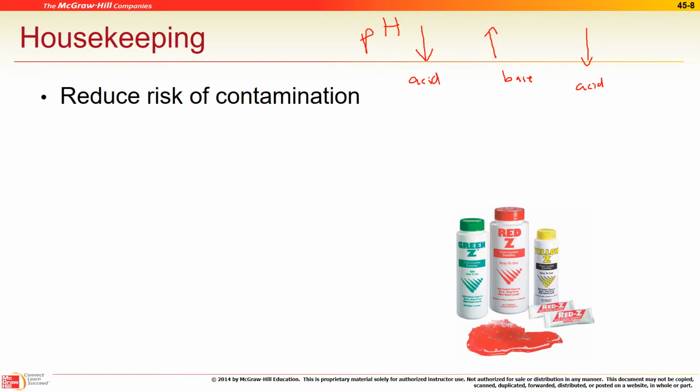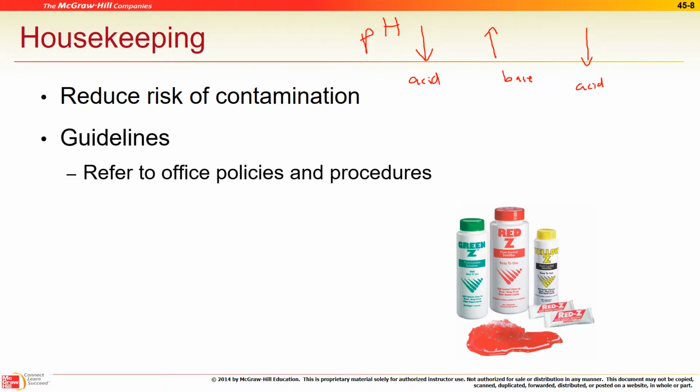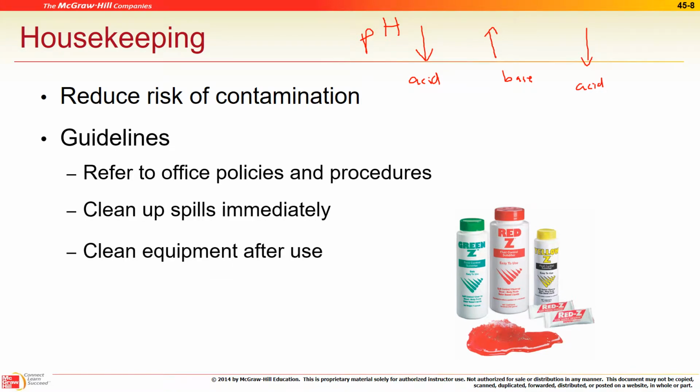This is the same in hospitals. Most of the superbugs are the ones in the hospital because that's where all the antibiotics are used. So all the strong ones are at the hospitals. Nowadays, for just regular household cleaning, you don't want to use anything that's antimicrobial. So what's happening is we are killing all of the good bacteria on our body as well. All right, clean up spills, clean up equipment, of course, and then dispose appropriately.